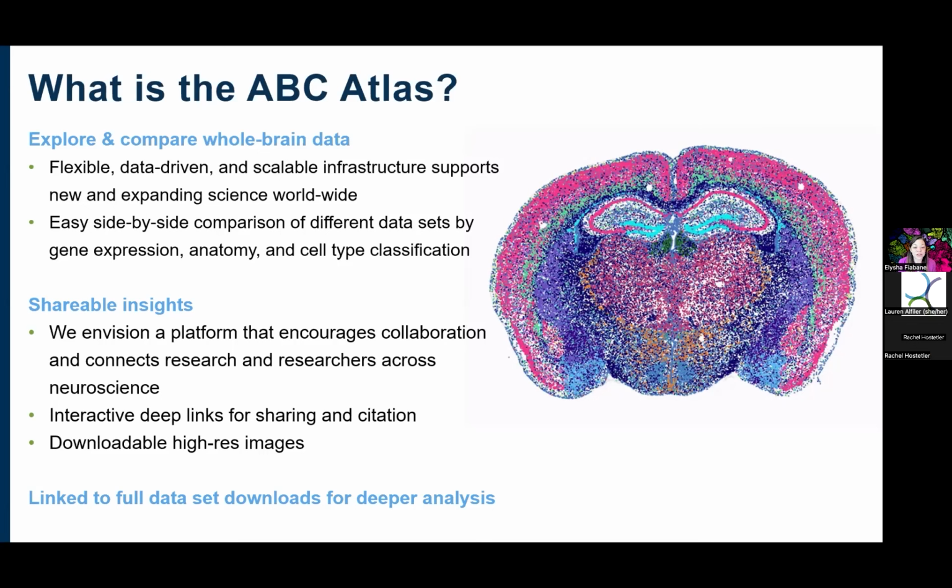It has the ability to show, at the moment, 4 separate data sets side by side. You can filter each one of them separately by gene expression, anatomy, cell type classification, and really get a sense for how these data sets are the same and different.